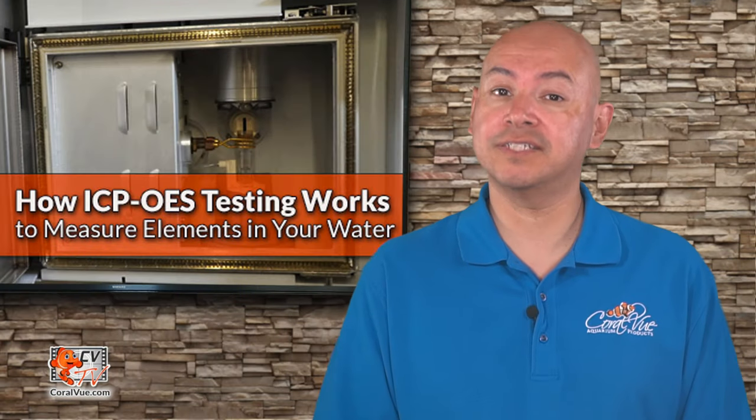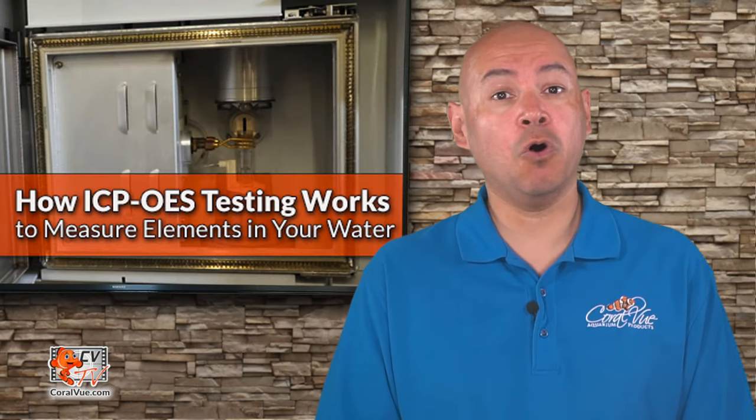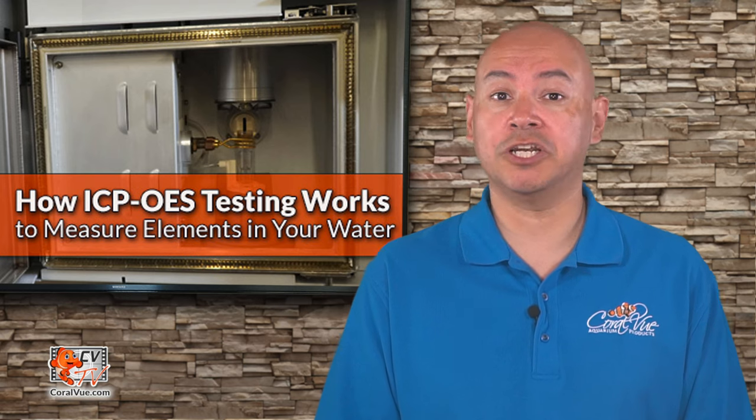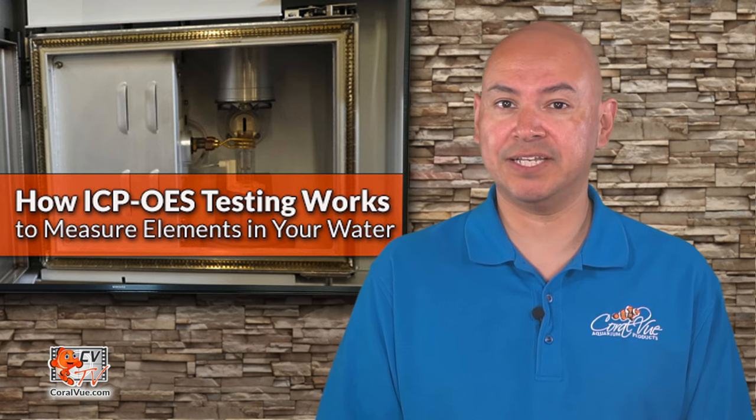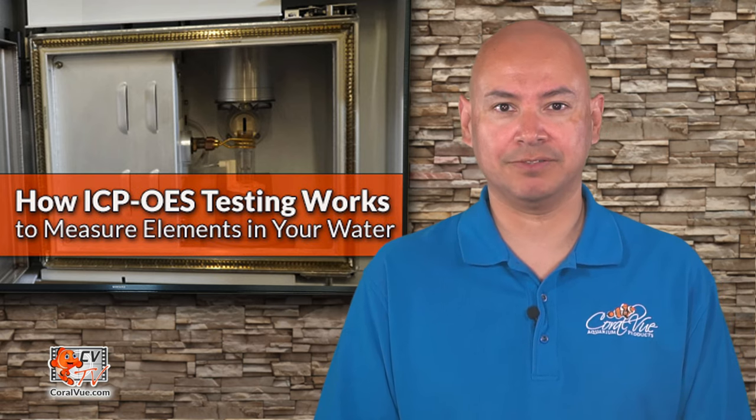Today, on this episode of CVTV, we go on location to share the ICP testing process and how it works.